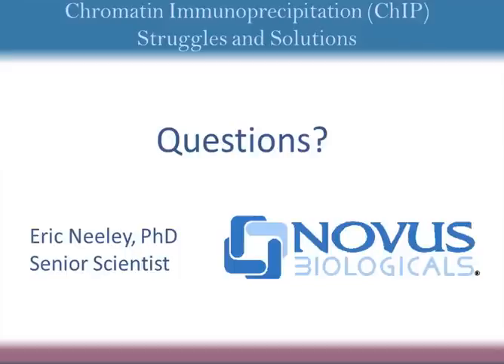Okay, so back to a more general question from Ziba Wunderlich. Sorry if that's not pronounced correctly. But she's saying, are there good guidelines for how much input material, such as tissue or DNA, you need for each step of the protocol? Do you provide those in your protocol?